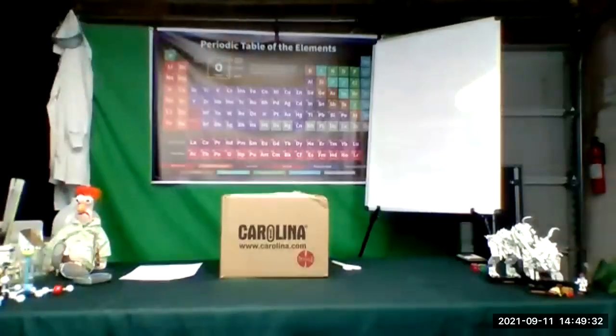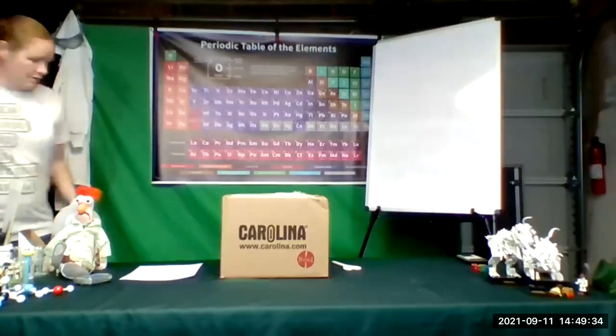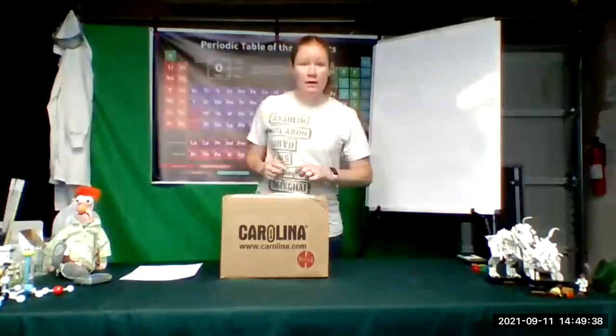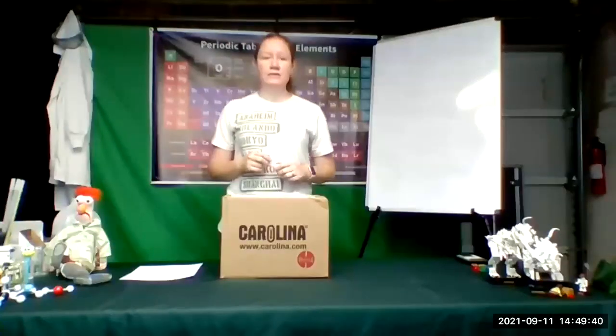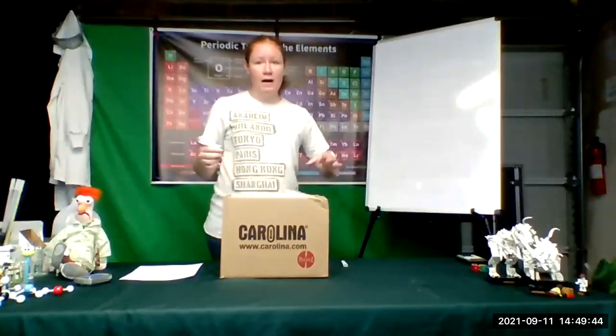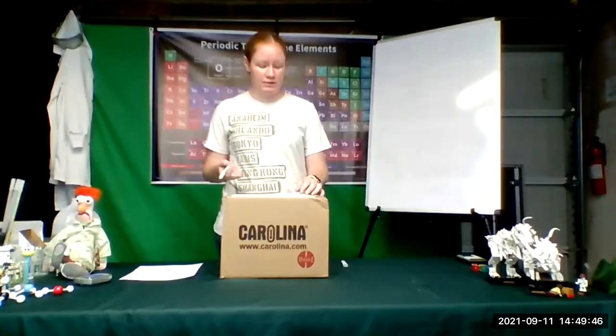Okay, now that everybody's lab kits should be showing up any day now, especially since our first experiment is this Tuesday, let's go ahead and unbox one of these so that you know what to expect when your kit arrives.